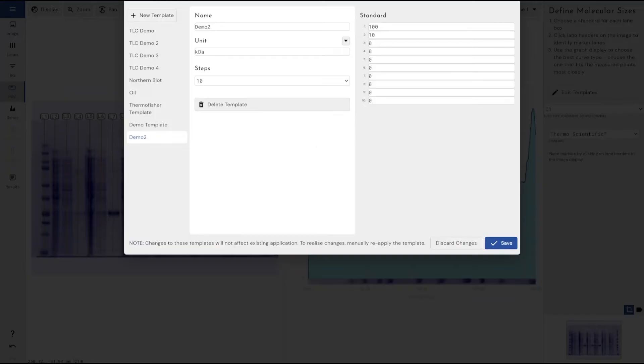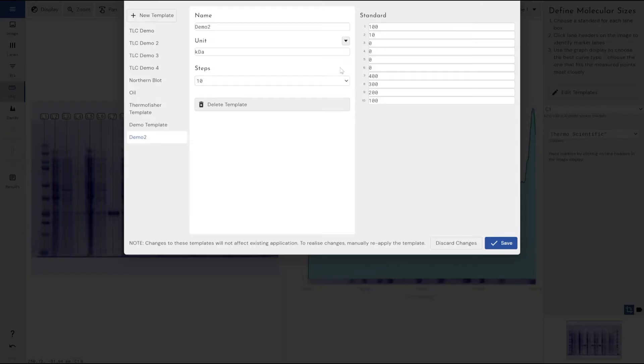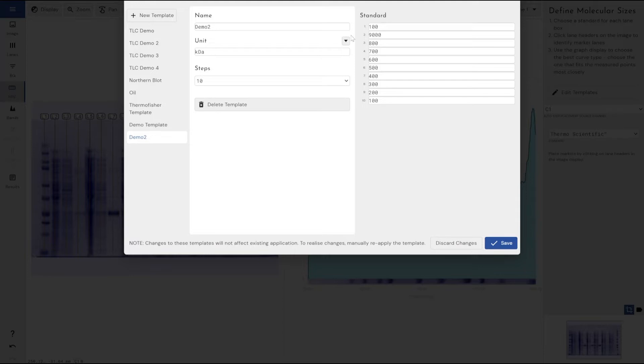Say if I had 10, I'll just go for a really easy 100, 200, 300, so this would obviously be in kilodaltons because I've got my unit set to kilodaltons over on the side there. 600, 700, 800, 900, and 1000.